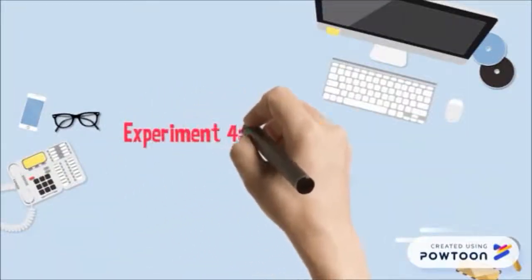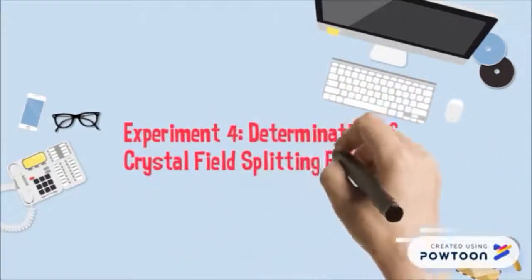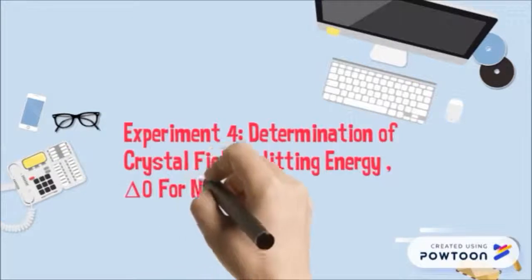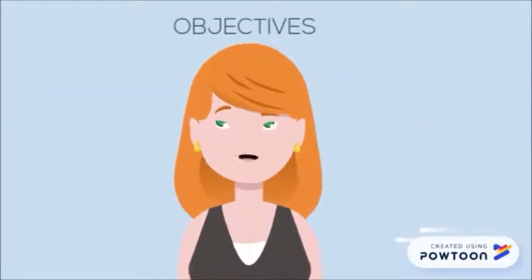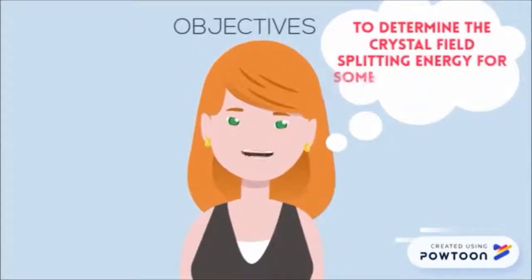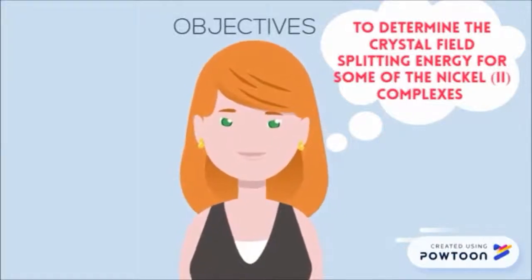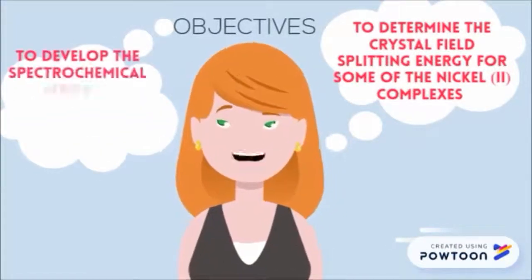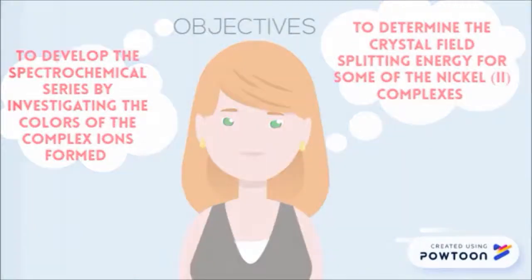Experiment 4: Determination of crystal field splitting energy, delta naught, for nickel(II) complex. Objectives. First, to determine the crystal field splitting energy for some of the nickel(II) complexes. Second, to develop the spectrochemical series by investigating the colors of the complex ions formed.